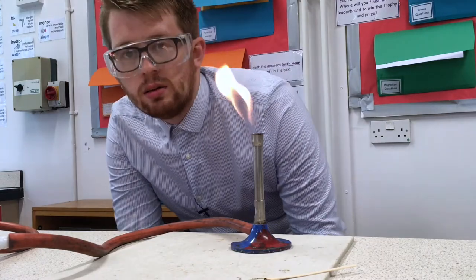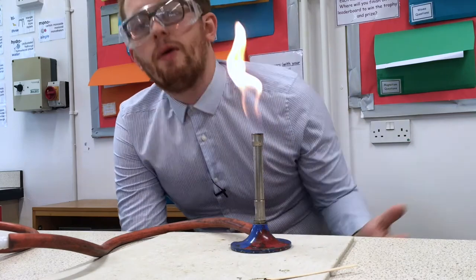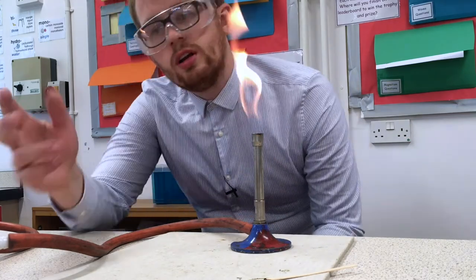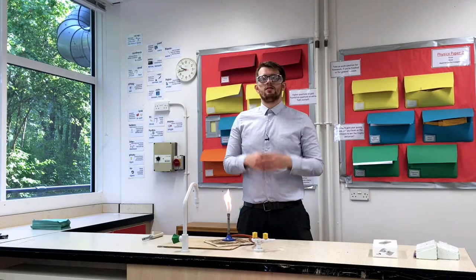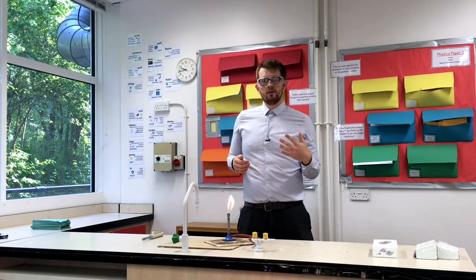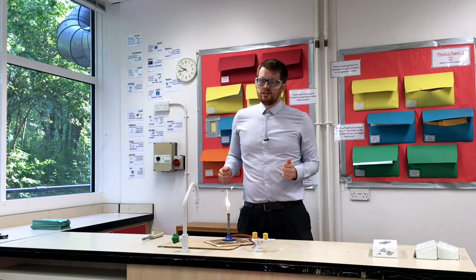Now your flame's lit and you've done your experiment, it's time to turn the Bunsen burner off. Please resist the temptation to blow it out — it's not a candle. All you need to do is simply turn the gas off. So there you have it — that's how we're going to light the Bunsen burner in the lab. Hopefully you found this useful and you'll be experts when we actually get to the lab.